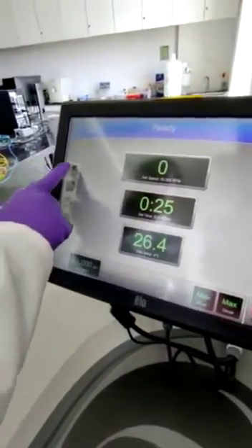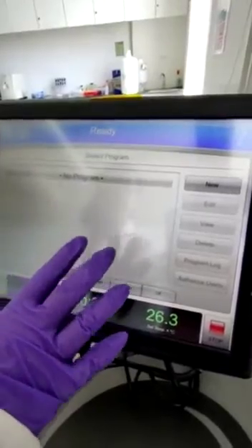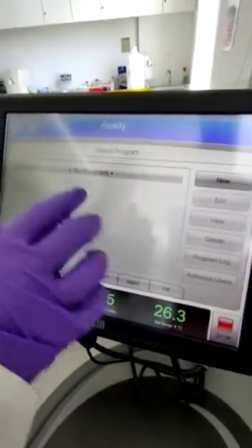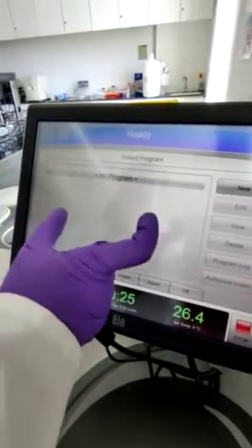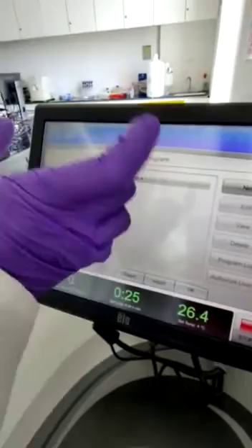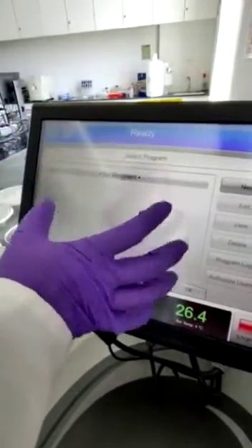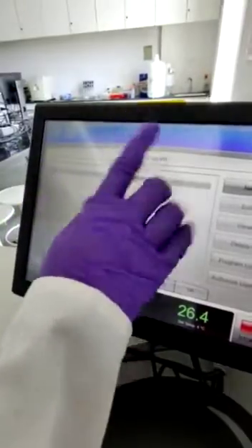You can have a look at these folders. Here we have a program which we can already set. This program stores how long your sample needs to run, the temperature, and the speed. Since there is no program currently set, it is shown as 'no program.'